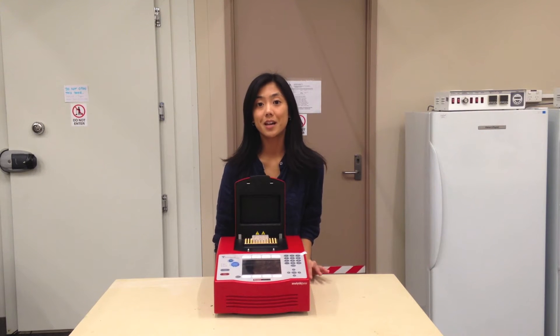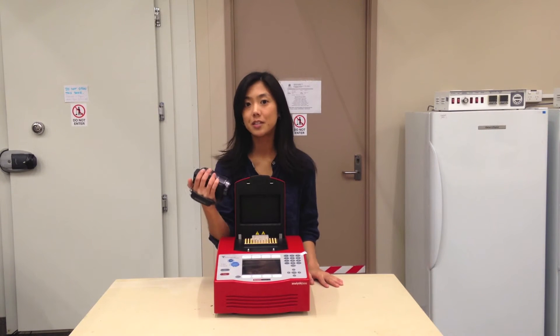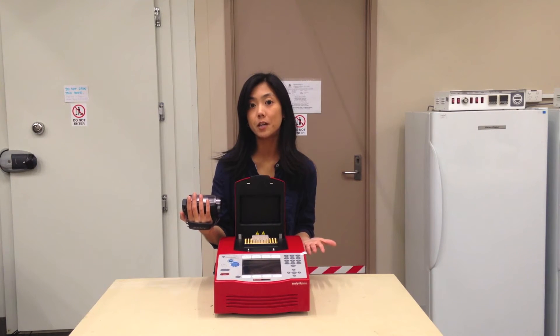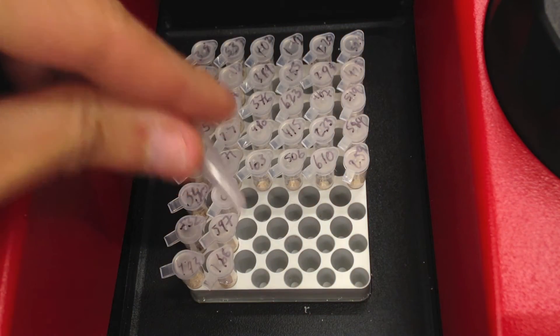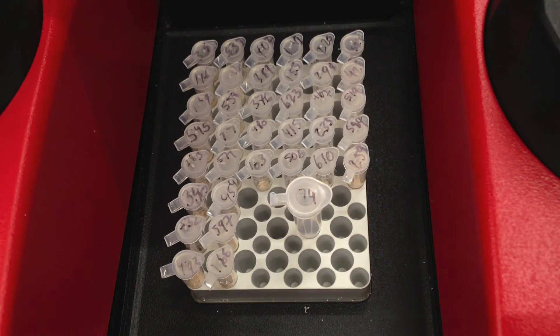Did you know that a thermocycler can work with the lid left open? This means you could set up a video camera to continuously monitor your invertebrates, at the expense of having your invertebrates exposed to ambient conditions. And if size matters, some thermocyclers can accommodate a larger tube so you can incubate a larger invertebrate.